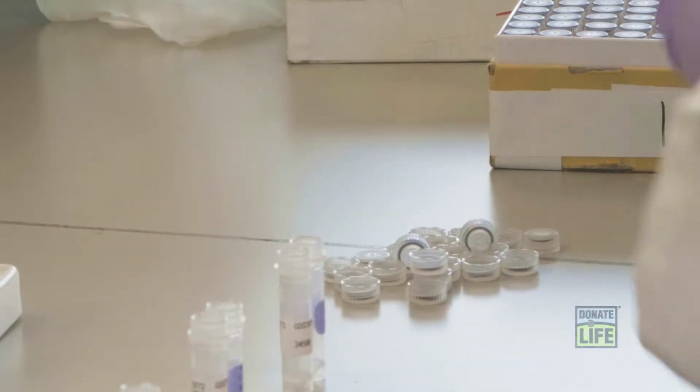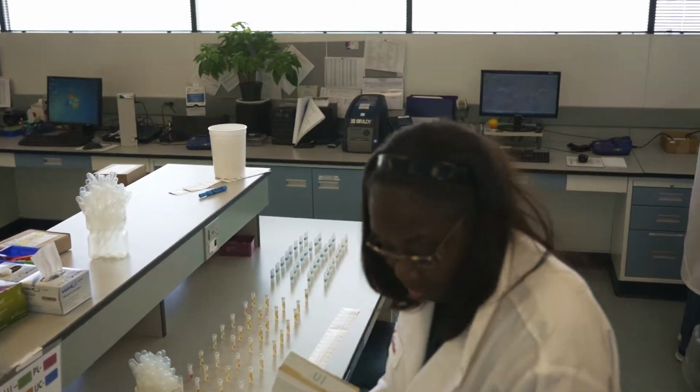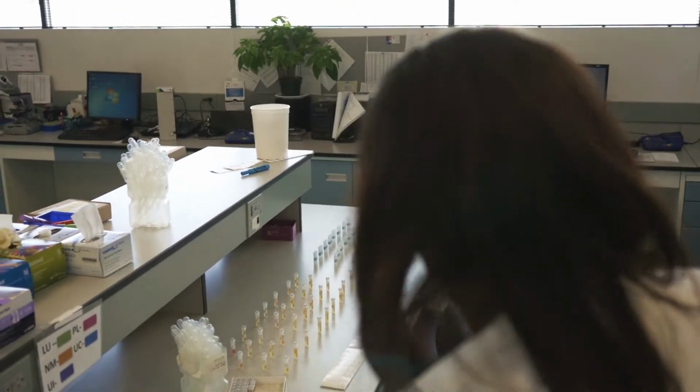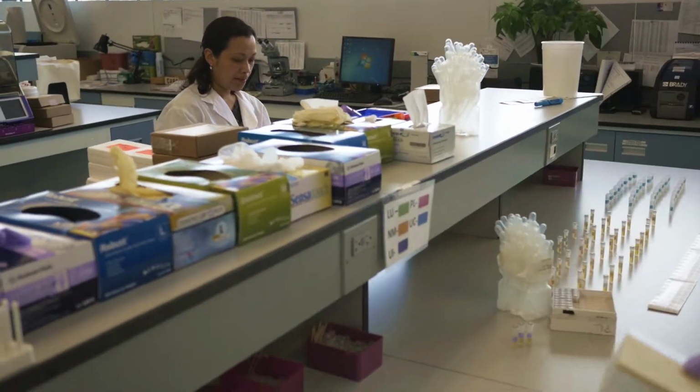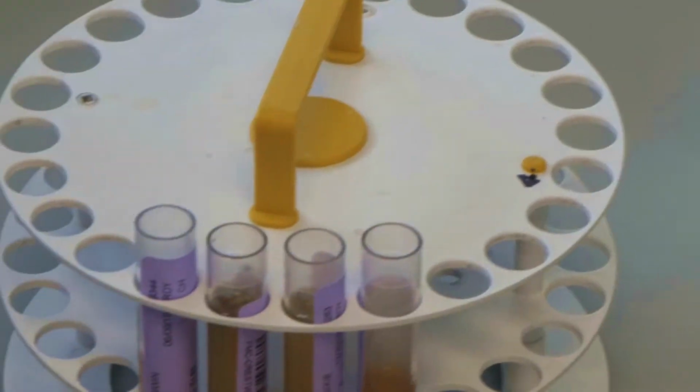Not only do we have to do it manually, but we also have to make sure that the name on the tube matches the name on the vial. There are many names that are very similar. Let's just say, by example, John Smith. There could potentially be many other John Smiths on the same list, and there could be a risk of putting the sample into the wrong tube, and we're thinking that we're doing the right patient.